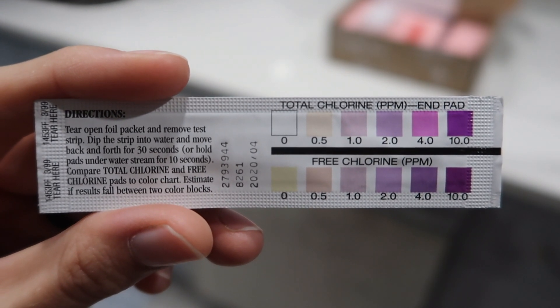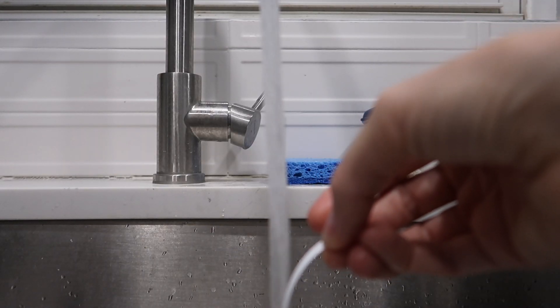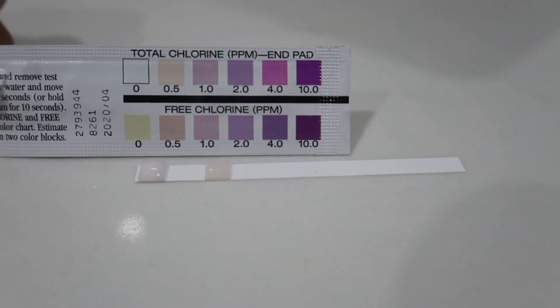Dip the strip into water and move back and forth for 30 seconds, or hold pads under a water stream for 10 seconds. That's pretty good — low level of chlorine, I'd say.